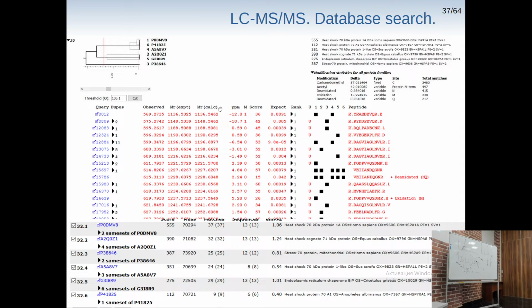Okay, so the other problem, aside from mass spectrometry here, is how to prepare our samples, because usually we want to have just a tiny bit of our sample, and if we try to digest it in solution, just put some solution, put some trypsin, we'll have a problem of extracting our peptides from this solution.